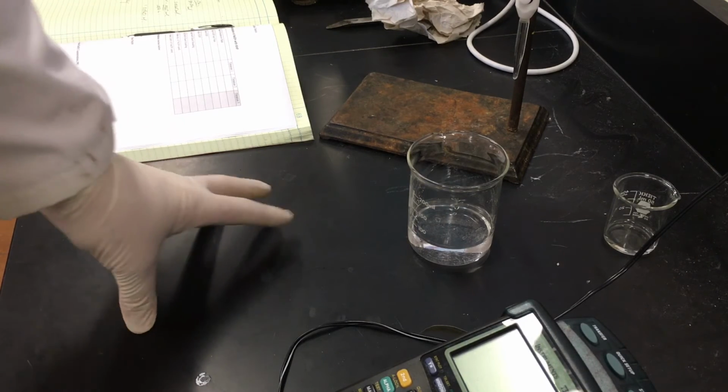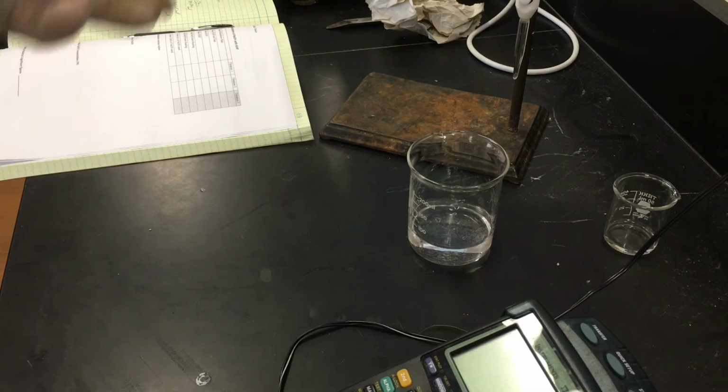And once the end point has been reached, which we will know because there will be a spike in pH, and our pH is going to go probably around 9.5 or 10. So once we get there, then we're going to resume adding the NaOH at 2 milliliters at a time until we've added about 38 milliliters or so, just to complete our graph.